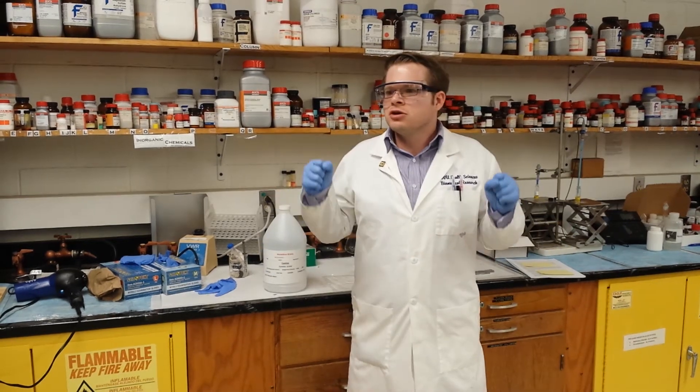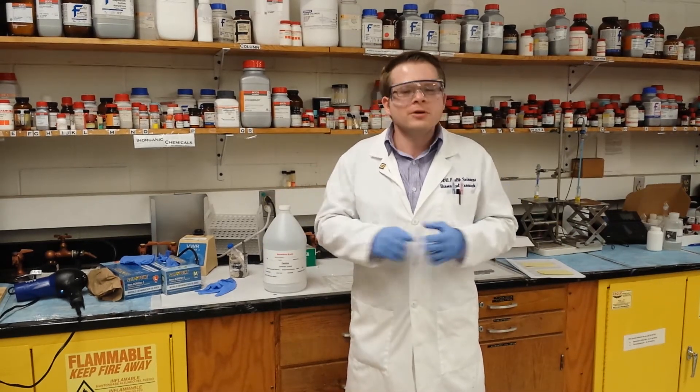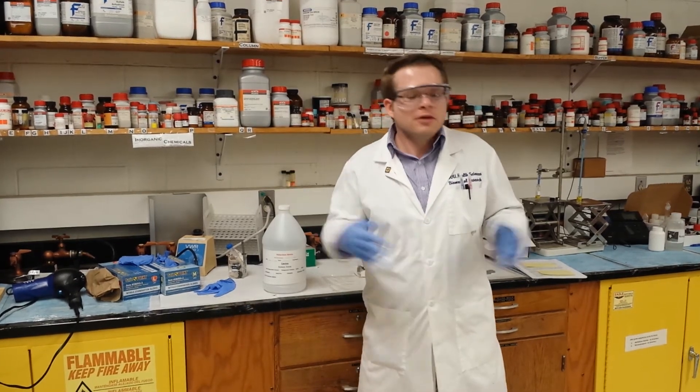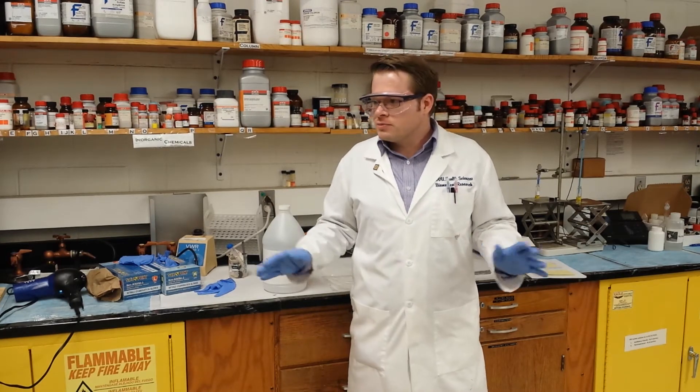It's such a unique and bright purple that you can't hide it. You'll be like a kid caught with your hand in a cookie jar. Just be careful. Minimize your spills. Minimize your incidents.